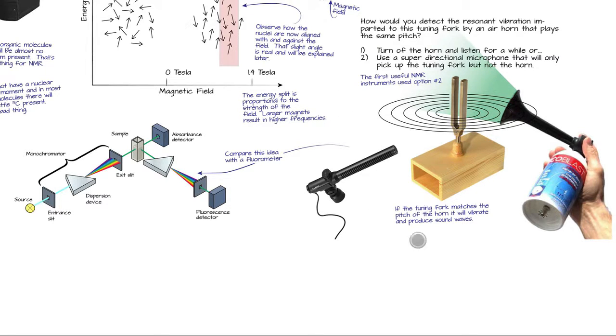So in some ways, this is like fluorescence spectroscopy. Here's a fluorescence spectrometer. We take a wavelength and we shine it through our sample, and if that wavelength is promoting electrons to higher energy orbitals, where they then settle down to the bottom of that energy orbital level, hang out for a few nanoseconds, and then fall back to ground state, they could be emitting light. And if that light is being emitted, it's being emitted in all directions. So my excitation wavelength goes straight through, and then I'm looking at 90 degrees to that, and I'm seeing the light that's being emitted, and I pick one of those frequencies, and I can get the fluorescence spectrum.